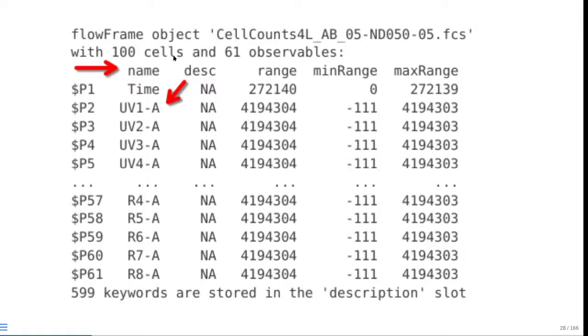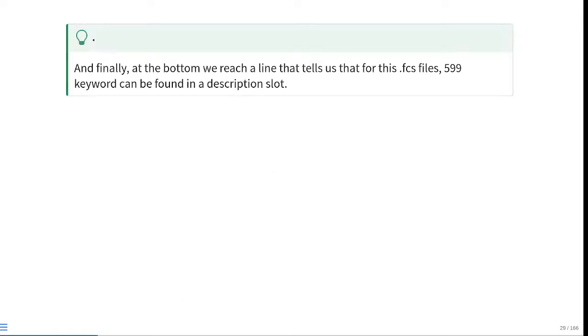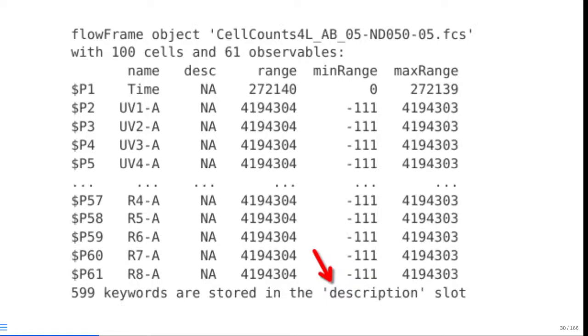And then, just like we saw, if we look into the actual columns, we can see the detectors on a Cytek Aurora are present. If you're using a different instrument manufacturer, you would see the corresponding detector names in the case of a raw spectral flow cytometry file. If you had already unmixed, this would instead be the fluorophores. Similarly for a conventional flow cytometry file or a mass cytometry file. And at the very bottom, we see keywords, and we should remember there are often keywords associated with the FCS file. In this case, it seems we have a lot of keywords potentially at play within this format.